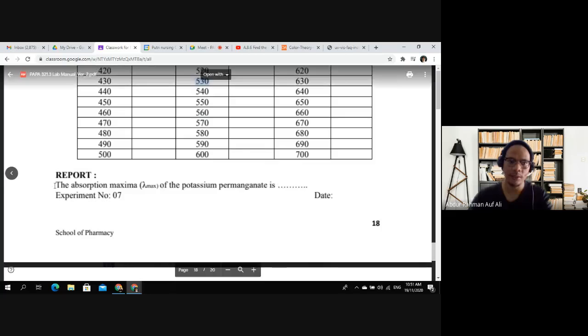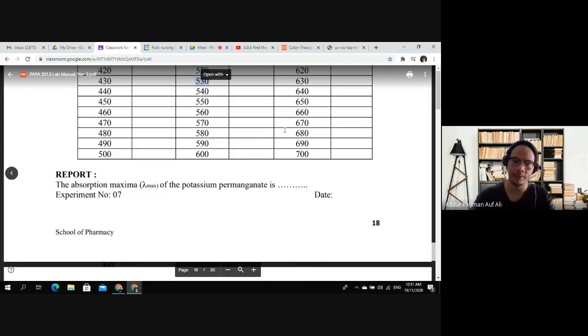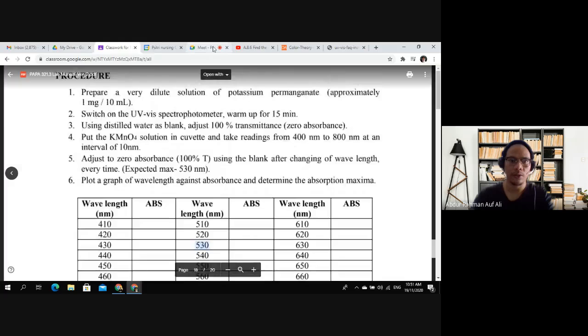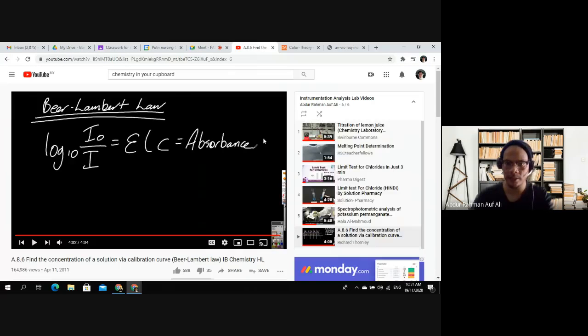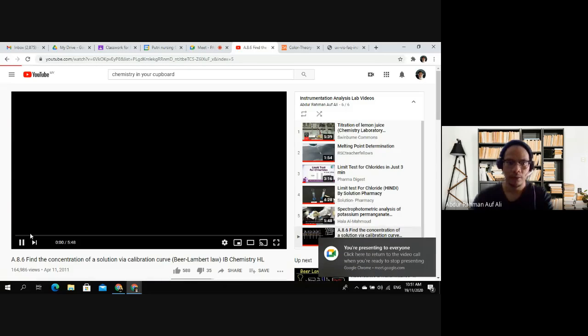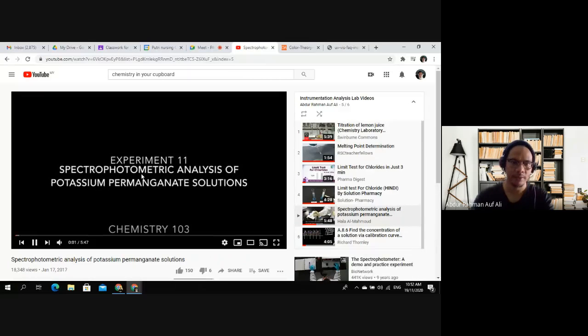Okay, so then report the absorption maxima, the lambda max, of potassium permanganate is 530. That's it. Okay, so there's a video of this also. I will share it on WhatsApp later. This is a 5-minute video. All the videos I share. So this video will show step by step how you should perform this test.